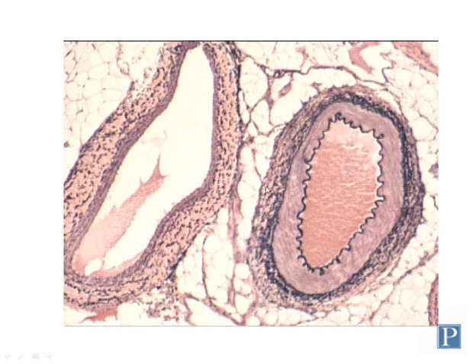So here again on the right we have a medium artery, and on the left there's a medium vein here. And the way we distinguish between small, medium, and large veins and arteries and arterioles and venules is really by approximating the number of layers of smooth muscle within the tunica media of these various structures. So reference your laboratory manual to get a guess at that.